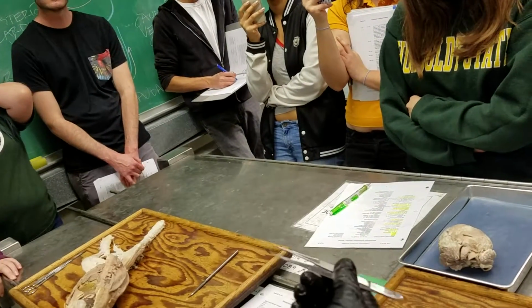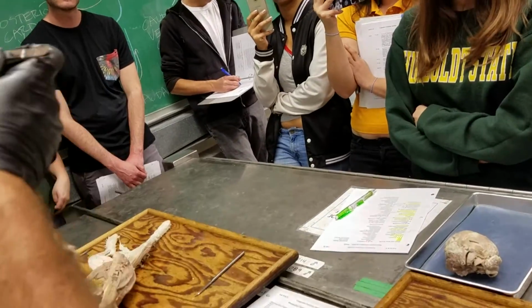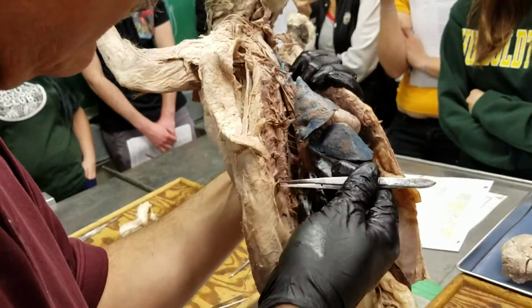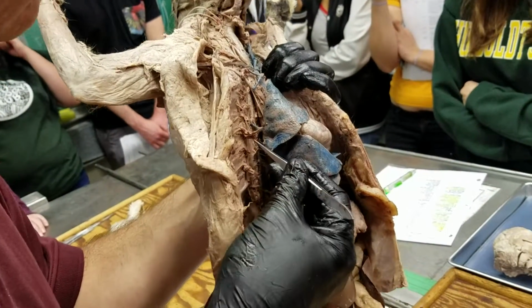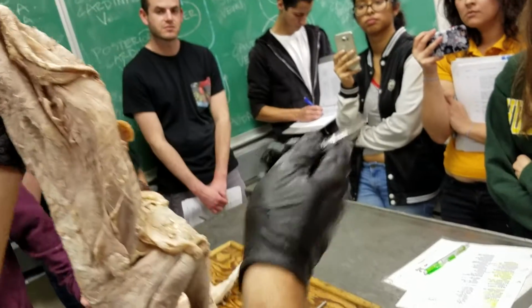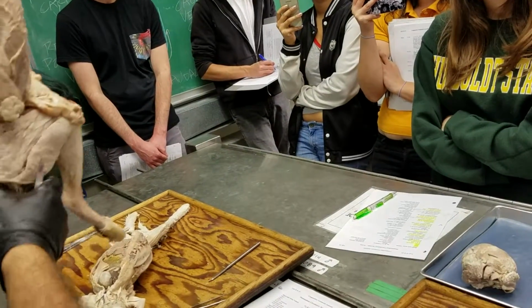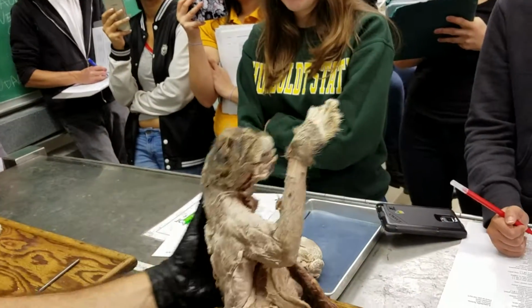And that's basically the posterior cardinal vein on the right side. Can I see it one more time, John, please? You can see how that is running along here, and it comes in and it joins in. Did you see that? Yeah. Joins in with the cranial vena cava, basically common cardinal coming back to the heart. So, wow. Thank you, cat. This is a big cat.